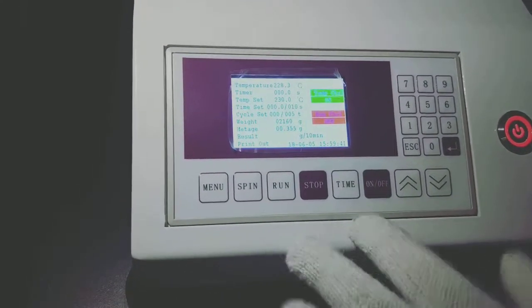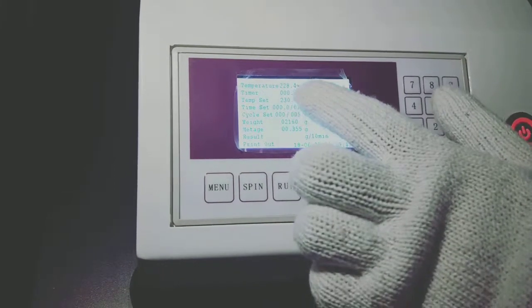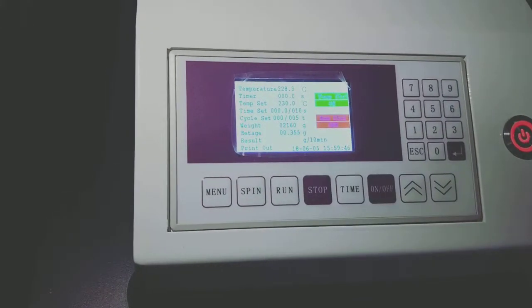And then we have set the temperature 230. And now it's almost reaching the set temperature. Now we will introduce the components.